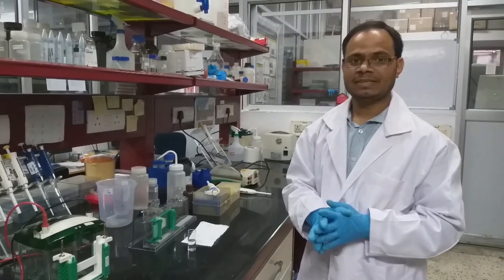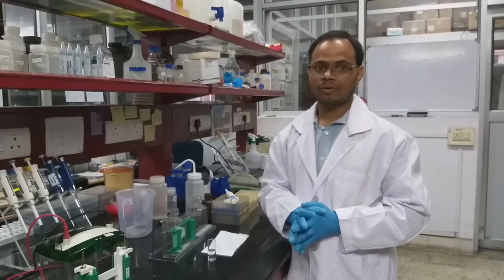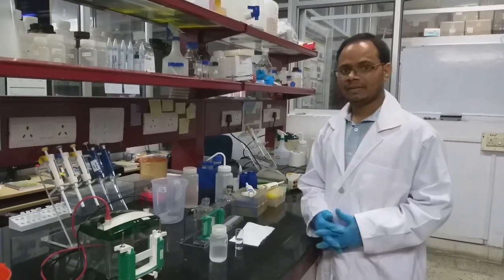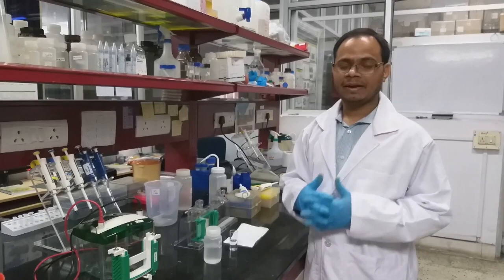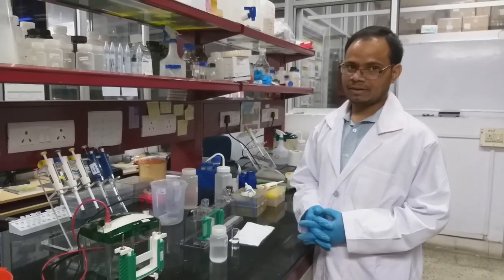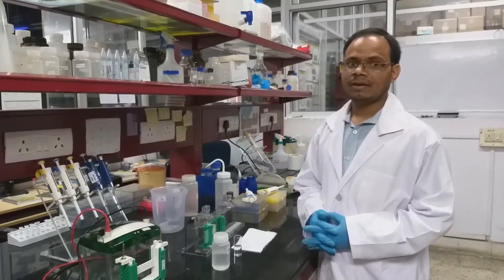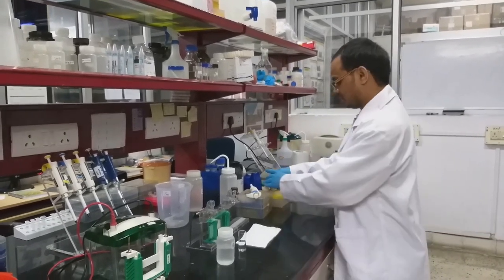Next component is SDS. Here SDS plays a dual role. One thing is that it gives a gross negative charge on the polypeptide chain. The next component we have to add is 10% SDS. We have to add 100 microliter of SDS to the resolving gel. It plays a very crucial role in polyacrylamide gel electrophoresis. It imparts negative charge on the polypeptide chain so that despite their charge, they will move based on the molecular weight. So I am going to add SDS.